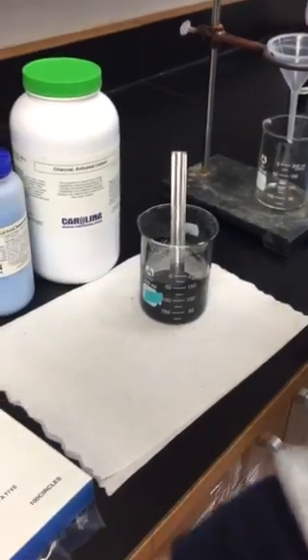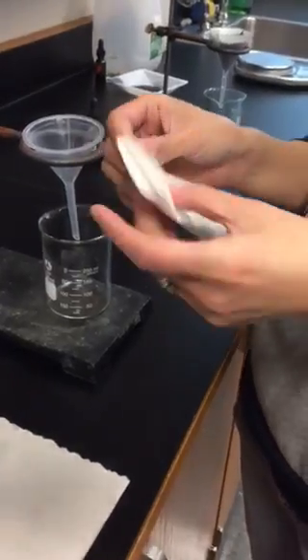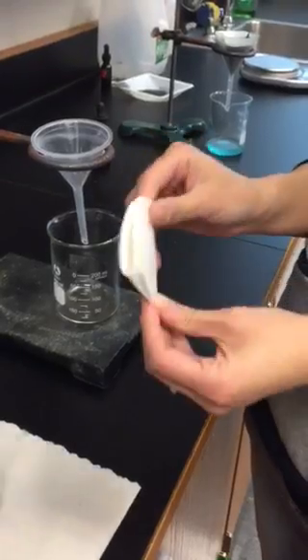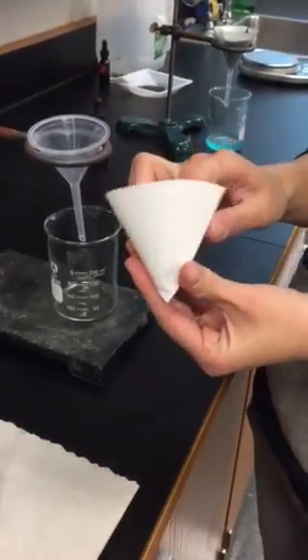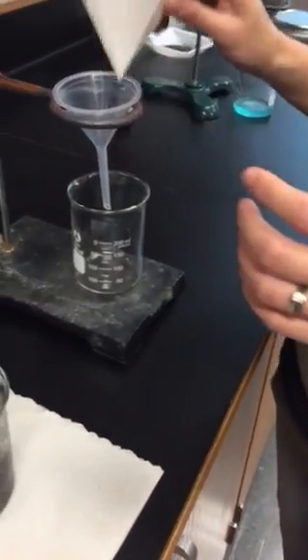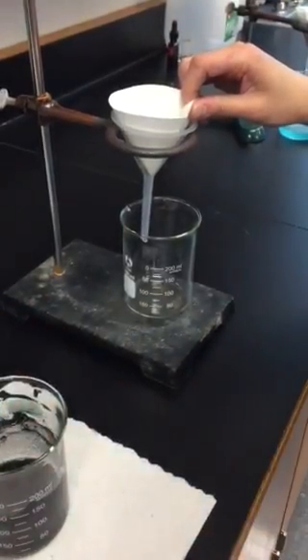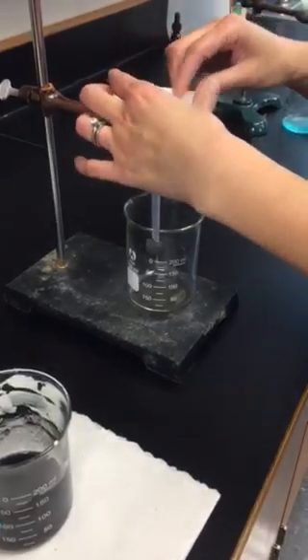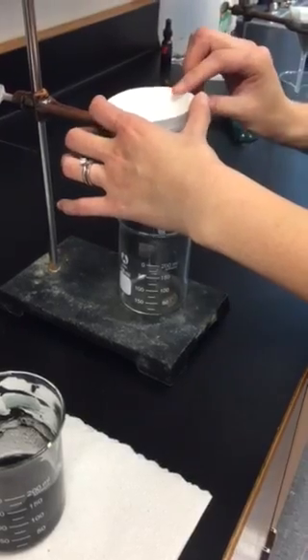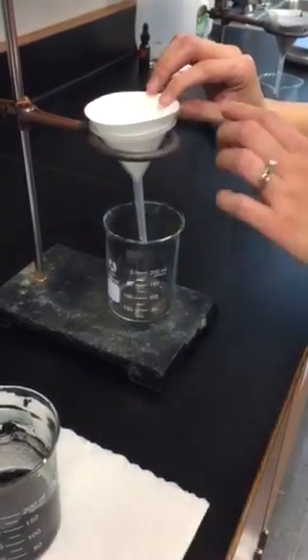When everything is ready, you're going to grab a piece of filter paper and then fold it twice. Then open it like a cone and put the filter paper on the funnel. It might not stay very well, so you can ask the students to wear gloves. Nothing is really toxic, so I'm not wearing gloves. You can hold the filter paper a little bit.